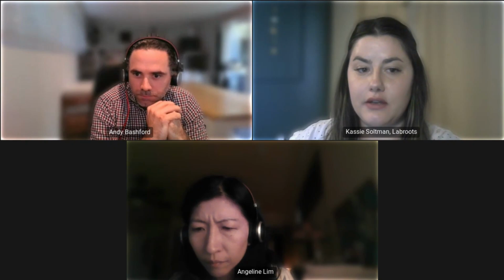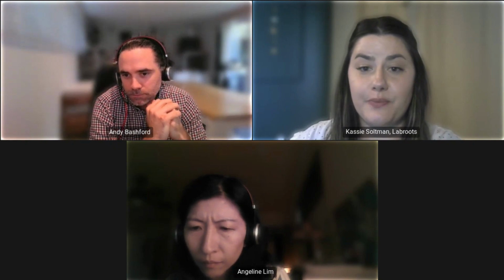Great, thank you. Our next question asks, do you store the expanded organoids for customers? Again, I think I'll take this one. In terms of the services we provide, the key thing is that it's a scale-up service. Customers will provide an organoid to us, we'll scale it up, and then provide that back to the customer. With that in mind, the vials are frozen and the projects are very custom.